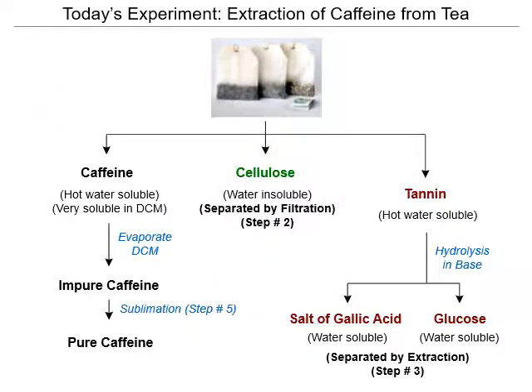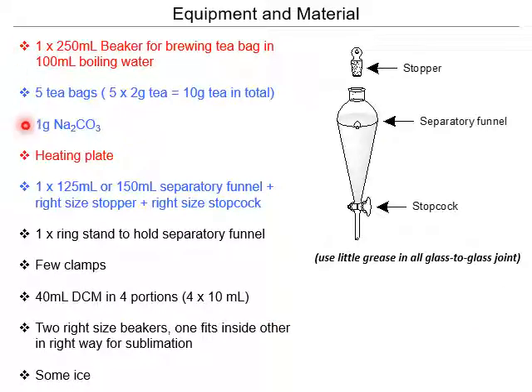What else? These are the equipment that you will use. Make sure you have a general idea and a specific idea as we go through it, so that you can answer questions on the quiz and you can understand this procedure more correctly.